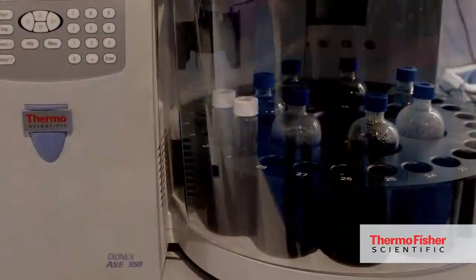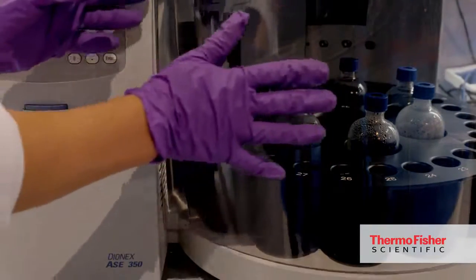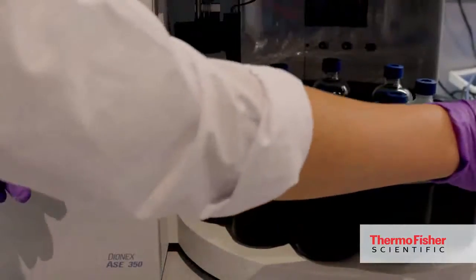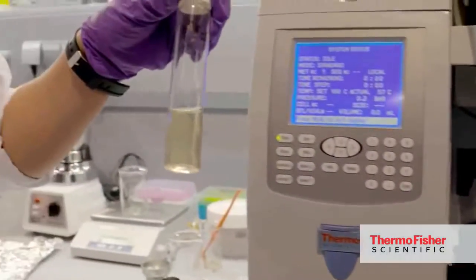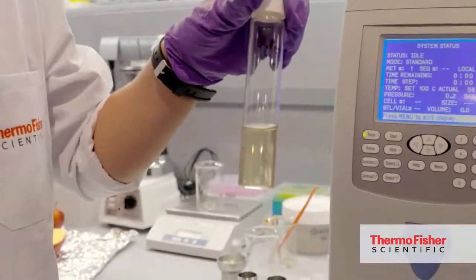So when the extraction is finished, we simply remove the vial with the extract, which is ready to analyze or for further preparation steps.